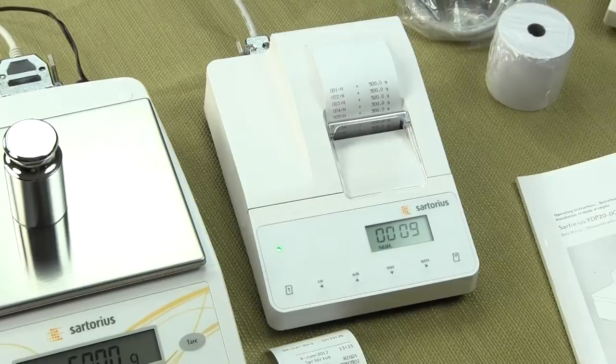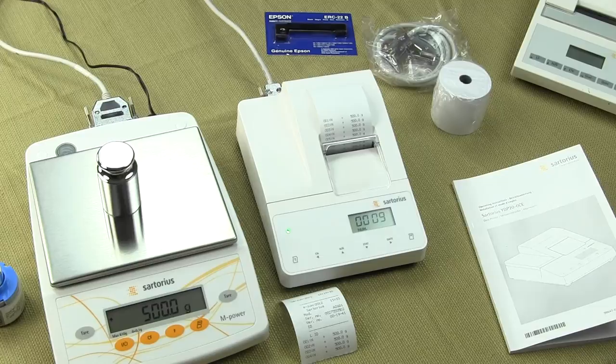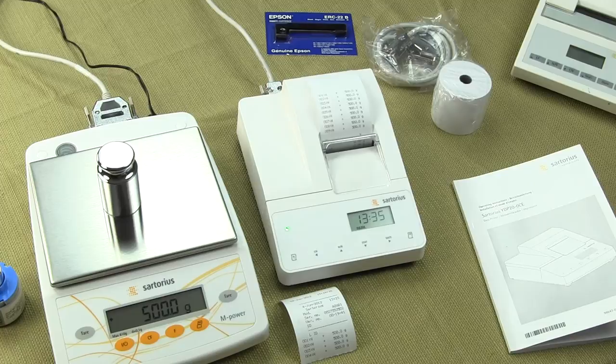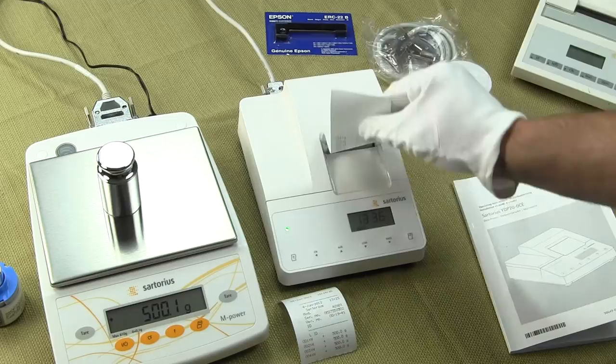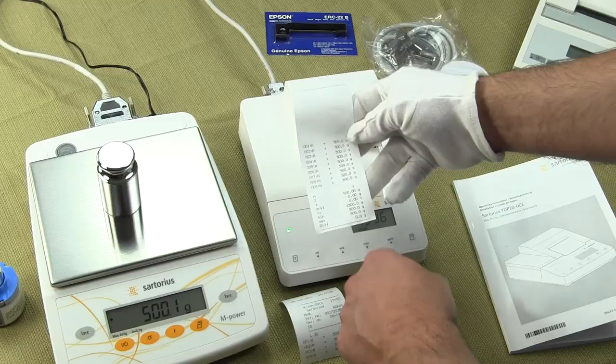The printer can output up to 24 characters per line and meets GLP and GMP compliance, so if you're in the pharmaceutical industry you'll know those requirements well. To get the statistics from our readings, simply press the STAT key and the balance will output statistics on all those readings. Here you can see we have 9 readings at 500 grams — it gives you the average, the min, the max, the total, and the difference.